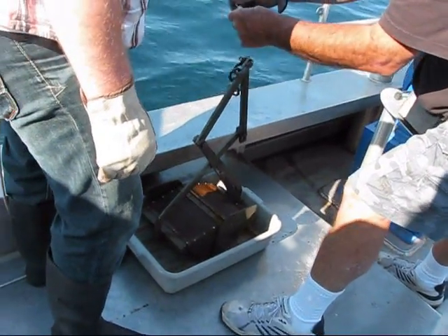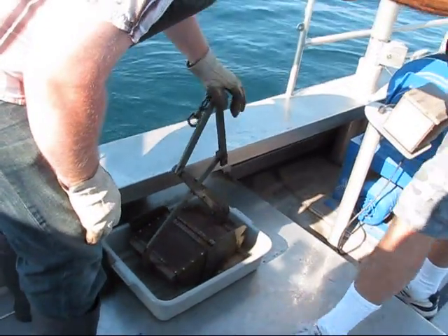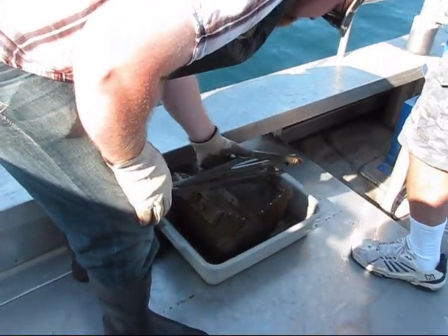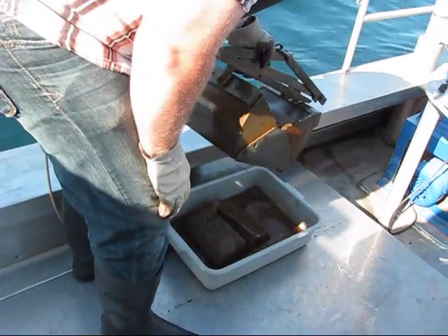Be careful you don't pinch yourself in this whole thing. You just push right from the top, straight down. Don't put your fingers down below there. Got it. Pretty sandy, huh? Well, that's what we want to find out. And then pull it off gently, just straight up. Straight up. And you can set it right behind you there.